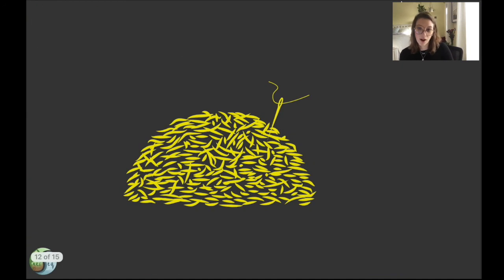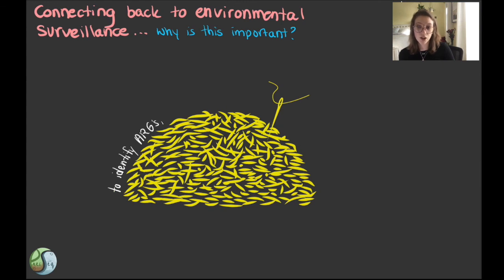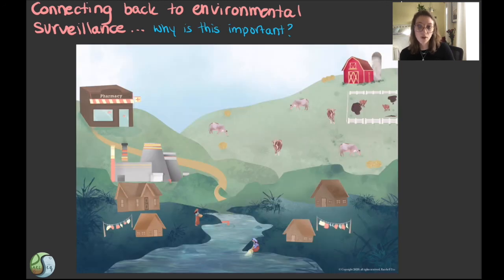So it's easy to get lost in the weeds when taking a deep dive into an area such as bioinformatics and antimicrobial resistance. But let's take a minute to put your findings from conducting this experiment in Galaxy into perspective. This type of environmental surveillance work, identifying what types of resistance genes are present in a sample and knowing what bacteria harbor those genes, can help us to understand exposure routes. For example, when people are exposed to antimicrobial resistant pathogens, is that occurring through food they ingest, contact with soil, or in some countries through drinking water?